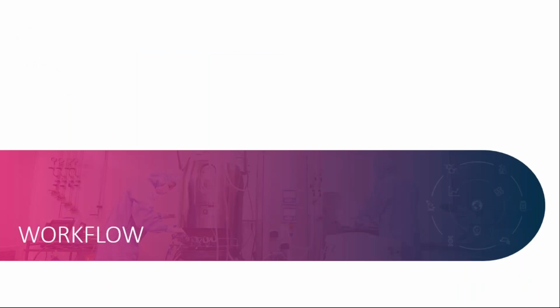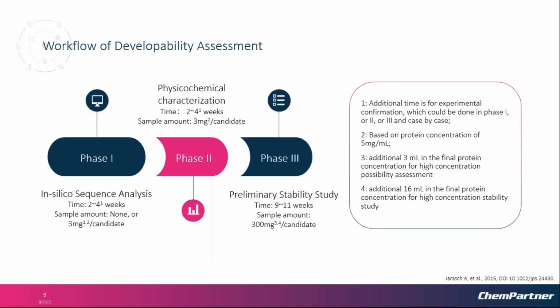Next, I will show you a general workflow of the developability assessment in our company. This slide gives an overview of our proposal. Since the antibody developability assessment is highly personalized, in the actual project the experiments will be added or reduced according to the client's demand and case by case.